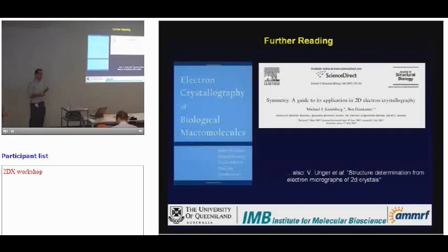If you know, for example, that for the biological function of something in a crystal cell, it has to be arranged in a certain symmetric way, and the symmetry you get out is different to that, then you really need to think about whether you trust the biological data or whether you trust the data that comes out of the computer. So there are some examples where it will pick up the wrong symmetry, but it's very easy to treat it correctly and treat it thoroughly. It's very easy to identify those incorrect symmetry assignments, and they shouldn't pose a problem.